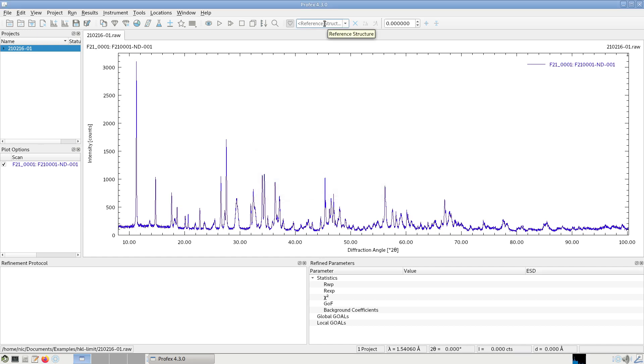So now if we select the reference structures, we will see that they have peaks all the way up to 100 degrees.